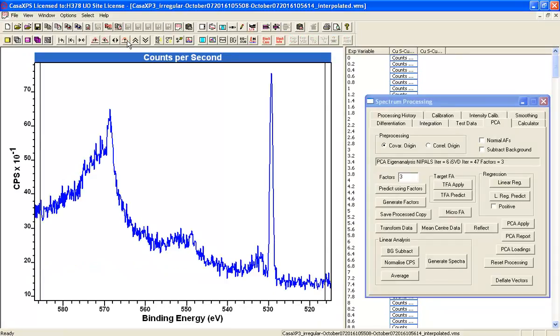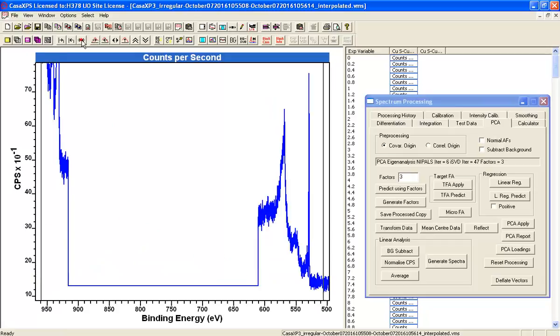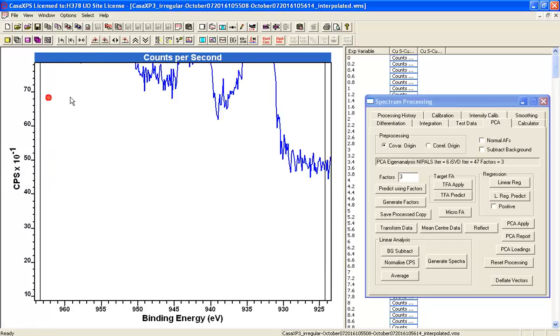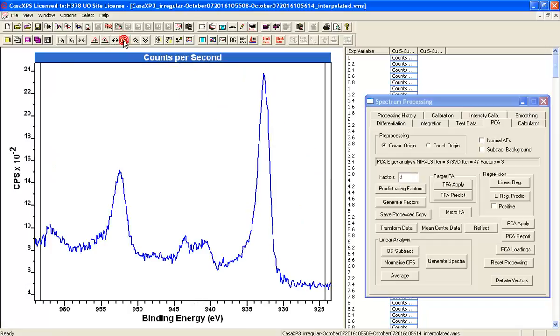the one that we're now looking for is something that will look like a Copper 1 plus state, as we believe this is potentially what is being generated as we do this measurement.